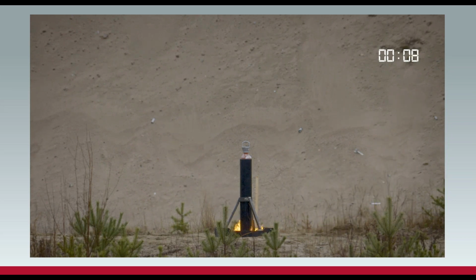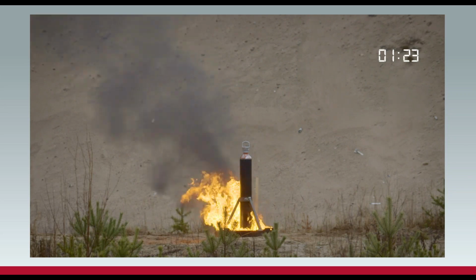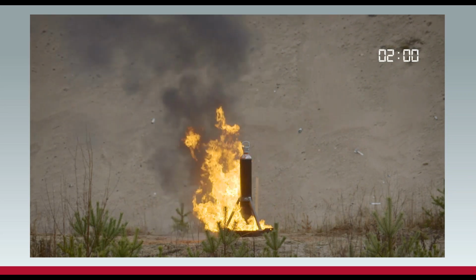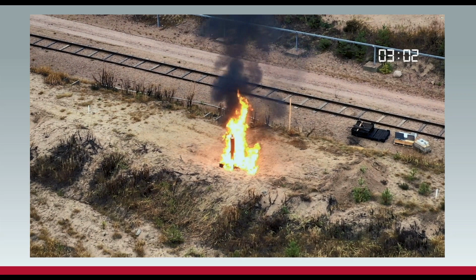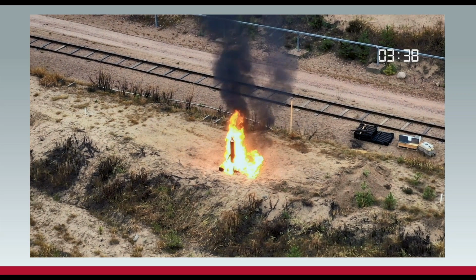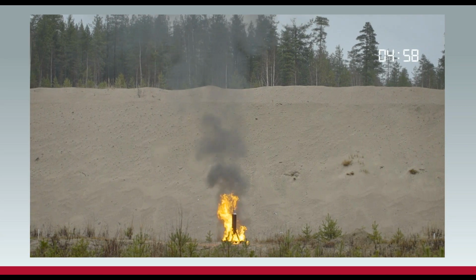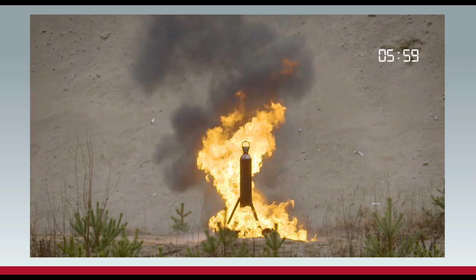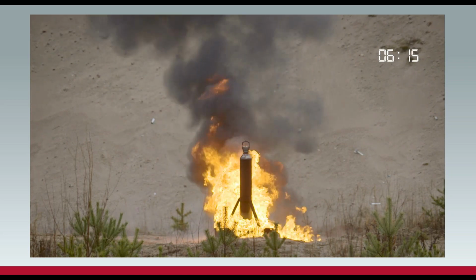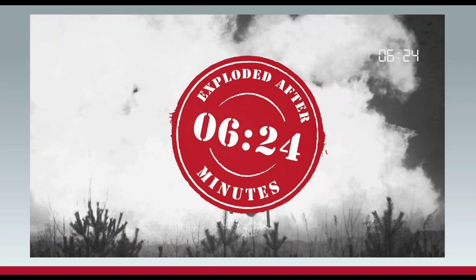Well, if a solvent fire happens, right now I have a solvent that's lit on fire on top of water, right? So water tends to spread things. The solubility doesn't work so well. And if you think of these things leaning against the walls and the designs and the way that we do things so they don't fall over, this is a catastrophic boom that happens here. There's definitely better means out there. There's technology out there that exists that's tried and proven. Matter of fact, it doesn't allow that to happen.